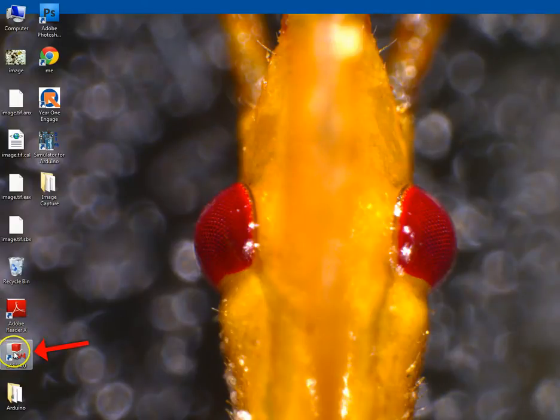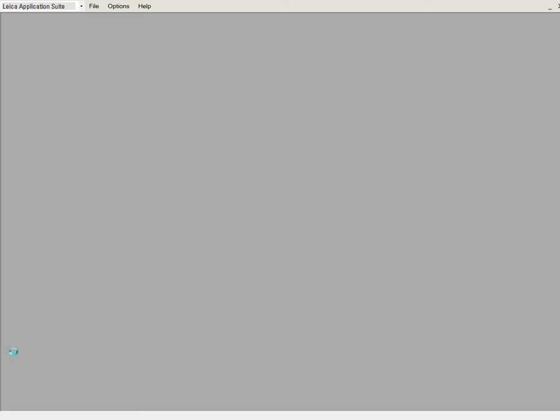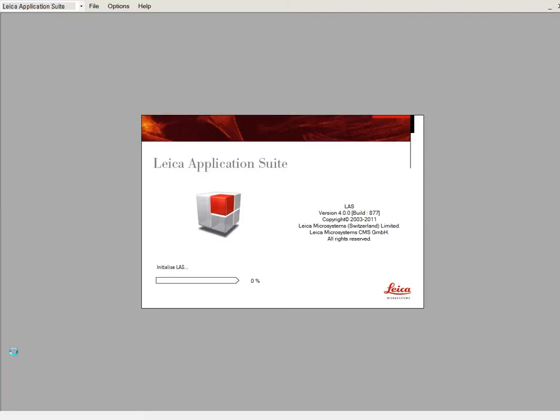So on the desktop in the computer lab, the LAS version 4.0 — that's your Leica imaging system. Double click on that and let that open.